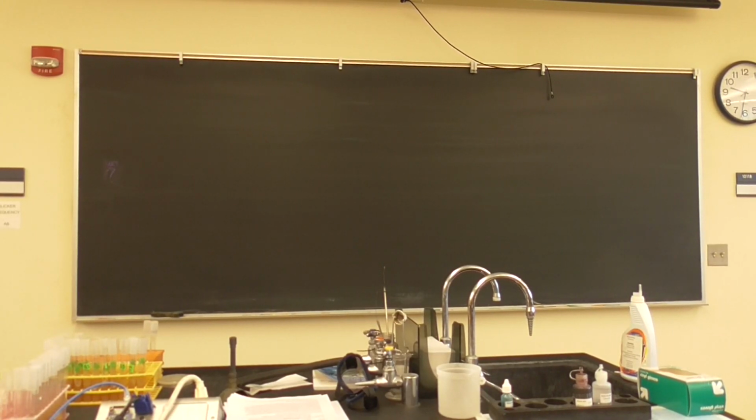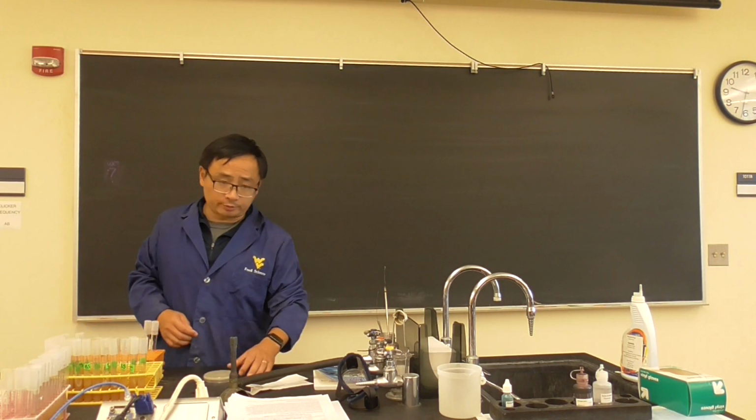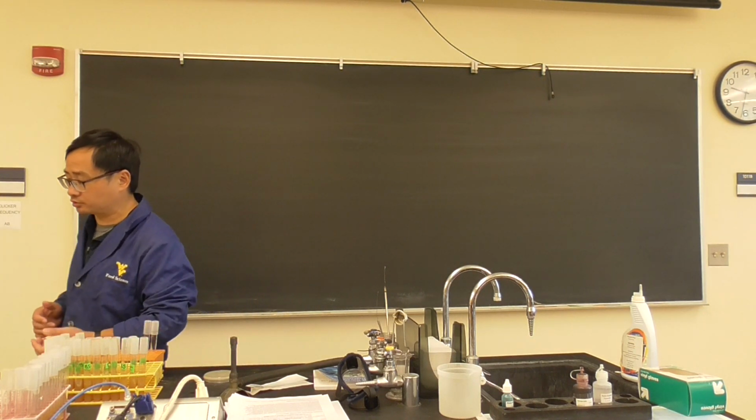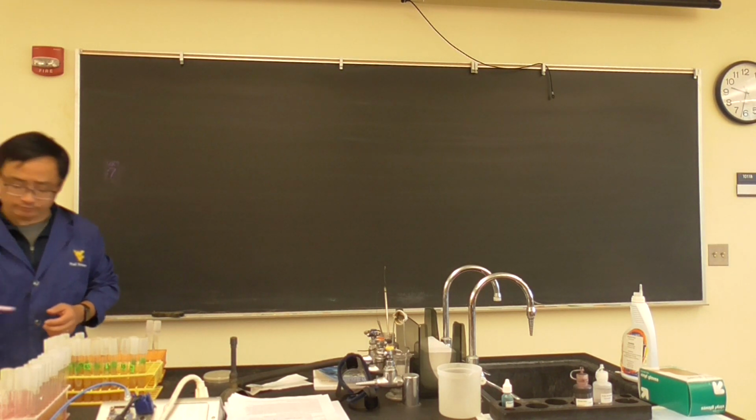Okay, let's have a class. Today's class, we're going to do aseptic transferring of bacteria, and we'll start to work on unknown number one. That will be the homework, and you and your bench partner work together.